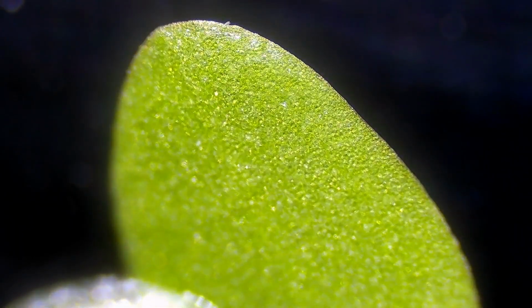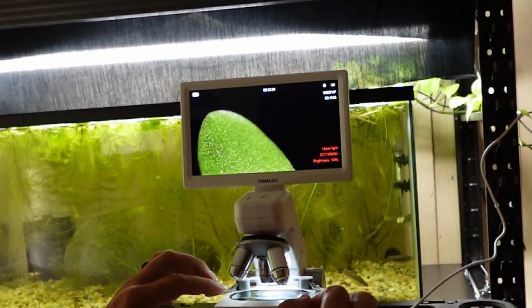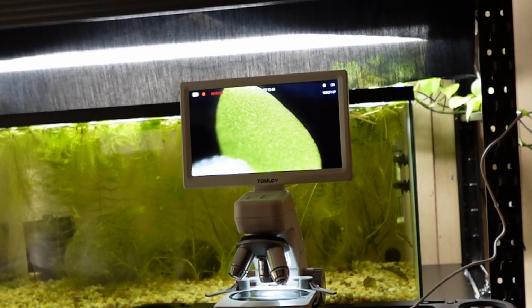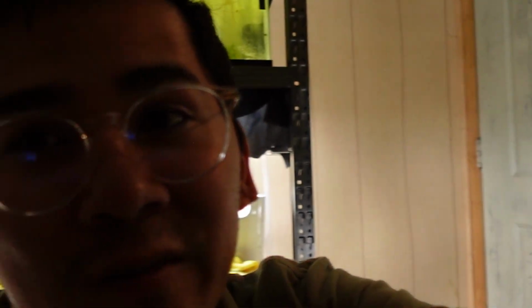I'm going to go ahead and do the underlight instead of the overlight. This is what it looks like kind of underneath the light. And the overlight once again. Crispen the image up a little bit. All right, if you guys guessed duckweed, then you're 100% right. That was duckweed.